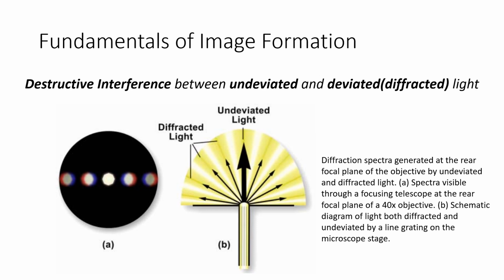So to capture the minute details, we want more diffraction orders to be gathered, more of this diffracted light to come to the objective. That is the purpose that we desire. All the diffracted light should come to the objective to identify the minute details.